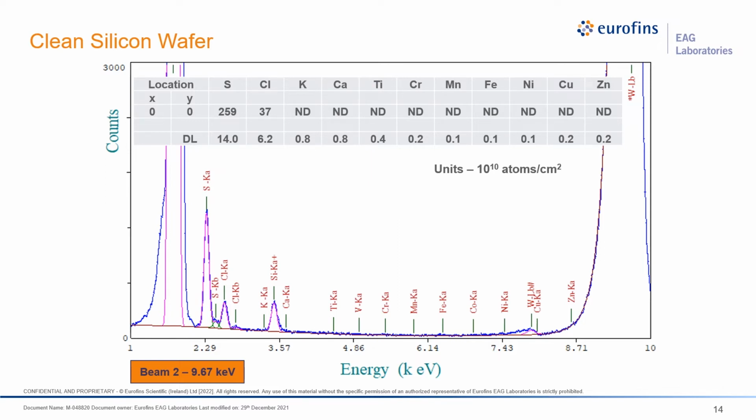So unfortunately, energy dispersive detectors aren't perfect. And sometimes you have the case where 2 photons reach the surface of the detector at the same time. And instead of being counted as 2 different photons each with their own individual energy, the detector will count them as 1 photon with the combined energy of both photons. So in this case, silicon K alpha sum peak has an energy of 3.48 keV, which is just twice that of the 1.74 keV of the main silicon peak.